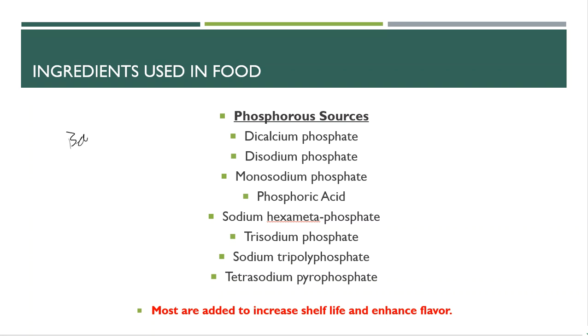This lab is going to be focused on beverages. In particular, it's going to be different sodas that we are going to be paying attention to at this point. All right, so we're narrowing down the field. So what will happen in this laboratory experiment is that we will bring in a couple of different ones. We're going to give you a variety of different types of soda. And you could have maybe 3 or 4 to test.